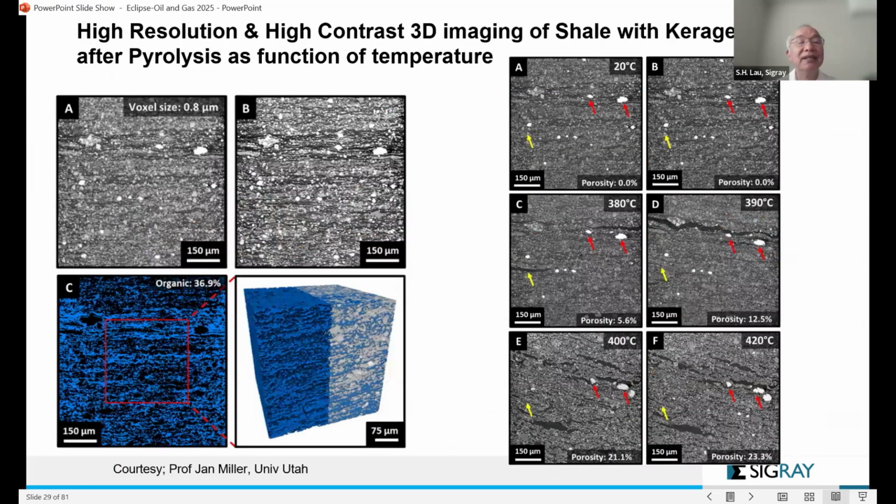Maybe I missed the explanation before. I just want to ask about the pyrolysis system here. Can this equipment do pyrolysis analysis in parallel with the visual analysis like this one, or do we do this analysis with the sample after pyrolysis from geochemistry analysis?